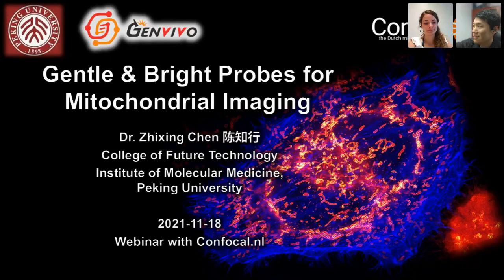Okay, that's a very good question. From a chemistry perspective, in theory, you can choose a dye of very low intersystem crossing. But in reality, cyanine dyes and rhodamine dyes are the most commonly used dyes for bioimaging. They already have a very low intersystem crossing, and much lower phototoxicity than other dyes like fluorescein. Also maybe there are other structures having lower intersystem crossing, but these dyes will not be as bright as cyanine dyes. Cyanine dyes are really bright.